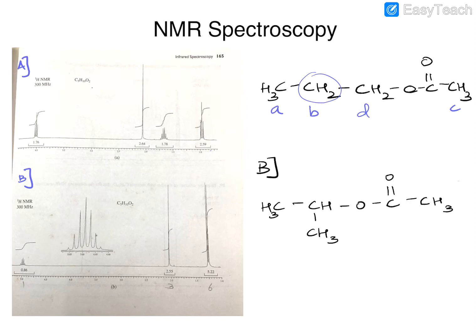Alright, so that's what we had as a scope for this particular video. I'll encourage you to go ahead and take up more examples of spectra and try to solve them based on the existing information. What we'll follow this up with will be principles of C13 NMR, and once we've discussed that, we'll go to higher order NMR techniques.